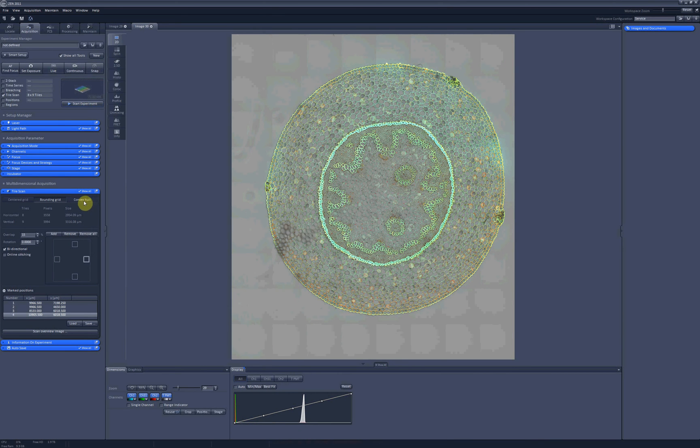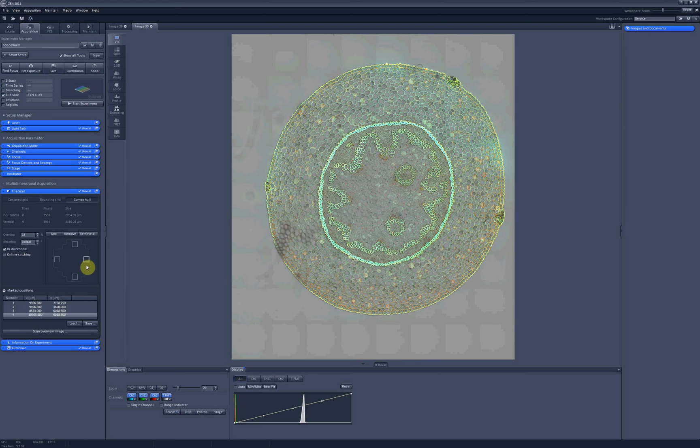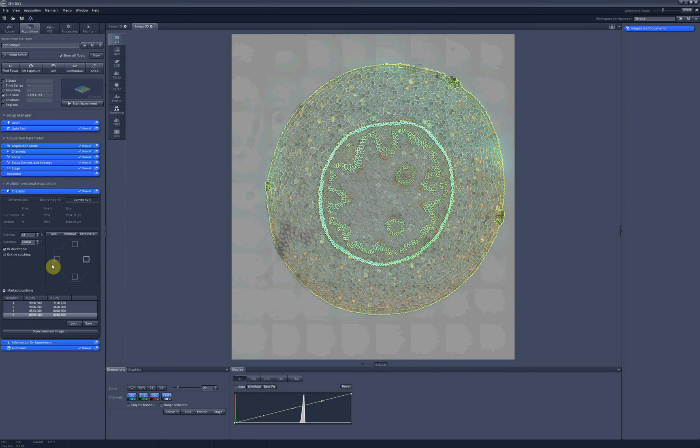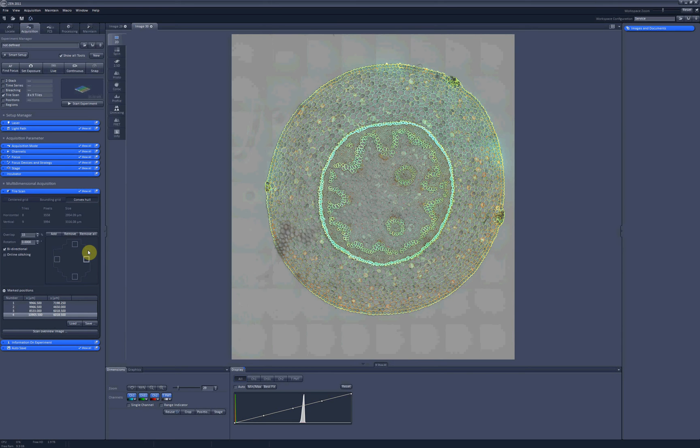The convex hull option is very similar. The only difference between the convex and bounding grid options is that convex hull tries to minimize the number of tiles you are going to need to perform your scan. And as you can see, it will most probably cut off part of my sample somewhere here. So when you use convex hull option, it's better to have more than four reference points for big round object.